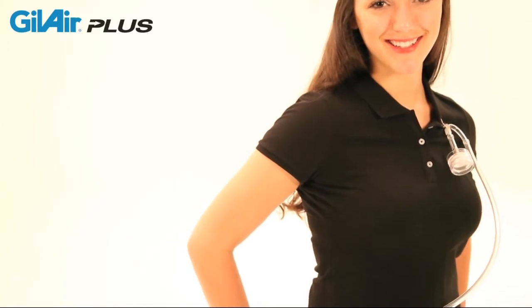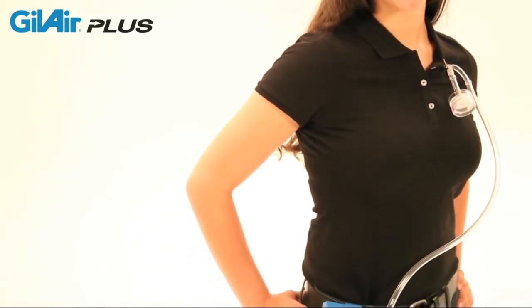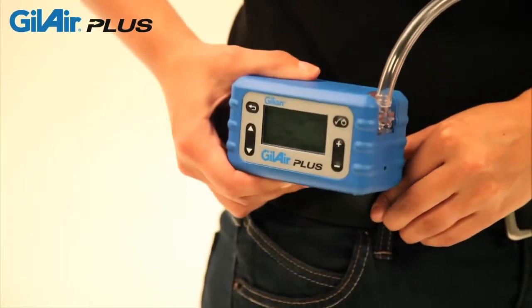The Gillian reputation for quality and reliability continues in the innovative GillAir Plus personal air sampling pump. GillAir Plus is the pump that does more.